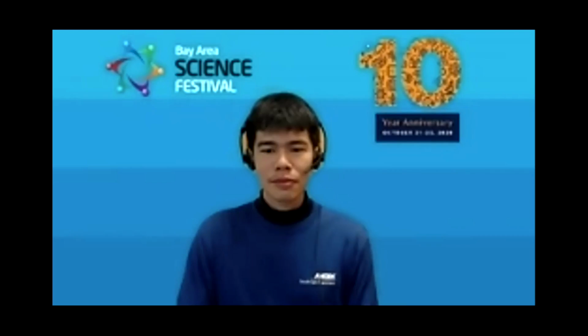Samir asked, what are common tools that you use every day? A laptop, of course, and everything you can see showing in the video. That's our daily life. We spend around 50% of the time in the laboratory doing tissue culture, and the other time attending meetings and preparing the notes for our experiments.